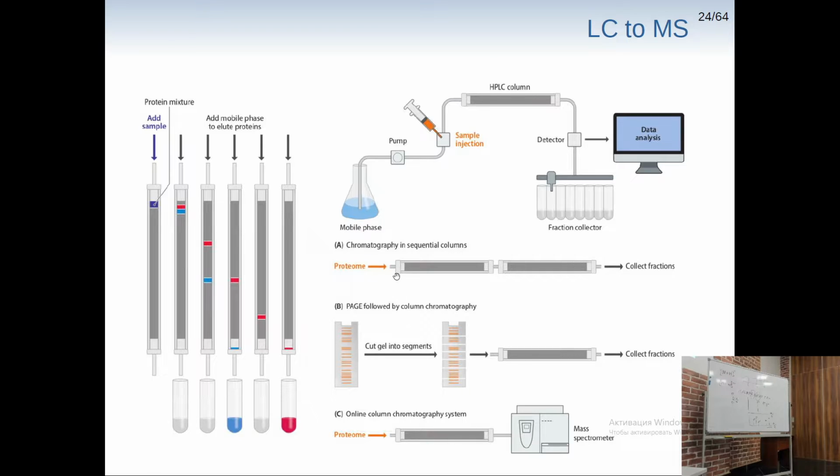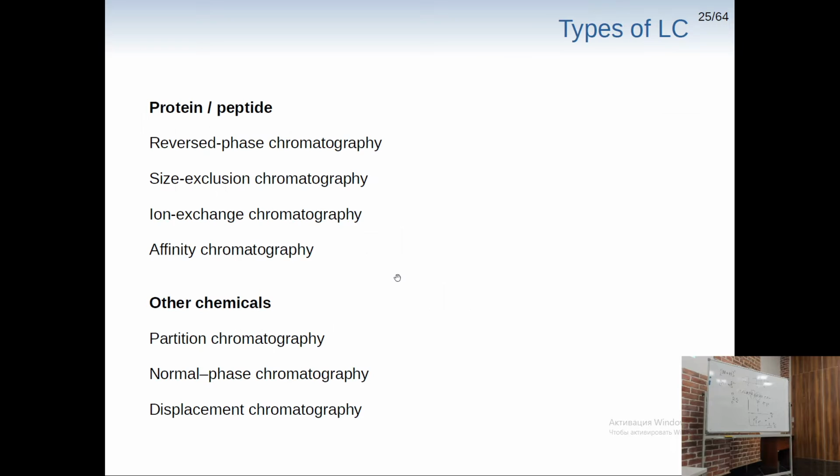The problem with a complex proteome is that we'll have either big or small signals, and we can lose the small signal if there is a big signal, or we can have peptides of the same mass, and if we fragment them in the same way, we'll get a mix of fragments from those two peptides, and we wouldn't be able to identify them at all. So if we can pre-fractionate them, we can identify them more easily.